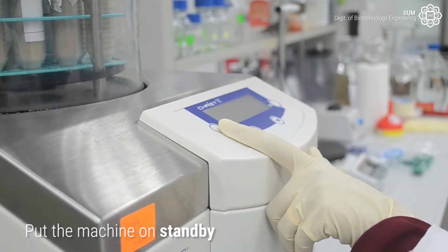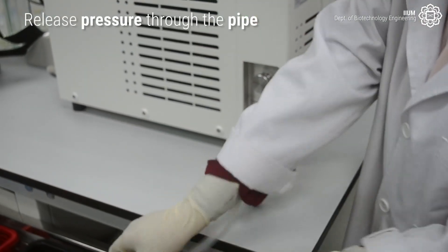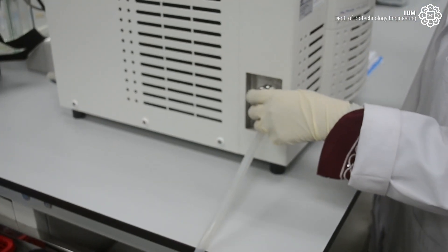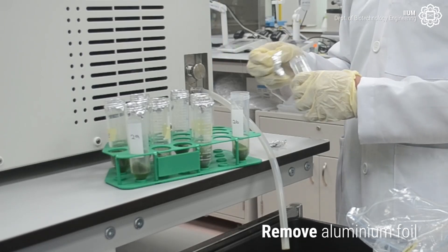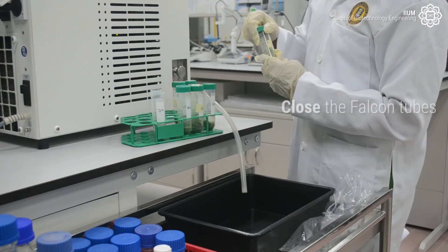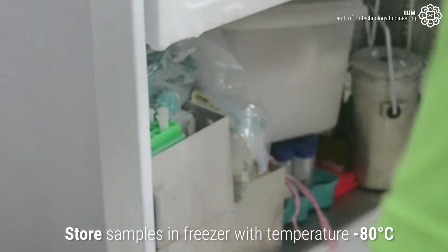After 4 days, put the machine on standby and release the pressure through the pipe. Lift the chamber and the shelf containing the sample. Remove the aluminium foil and close the falcon tubes. Finally, store the samples in the freezer at minus 80 degrees Celsius.